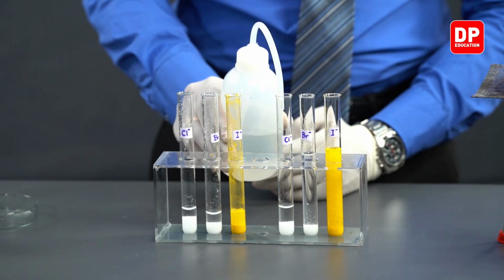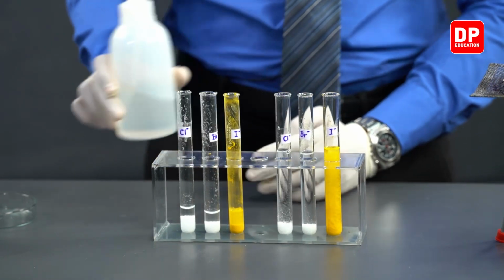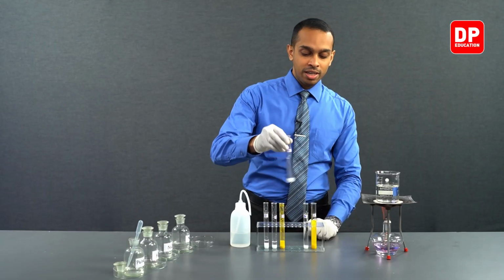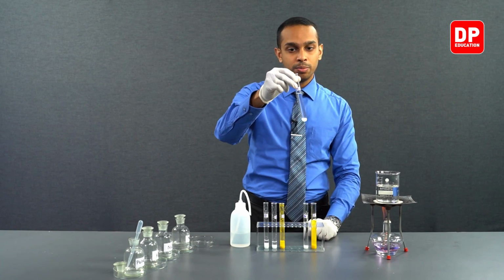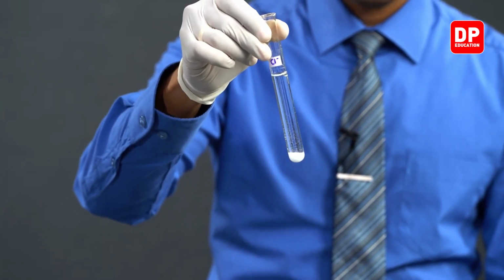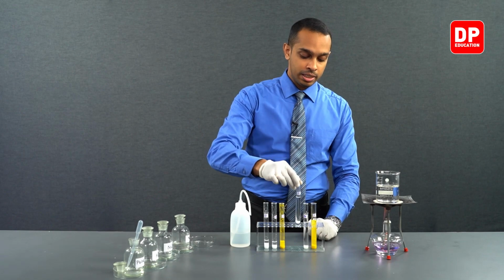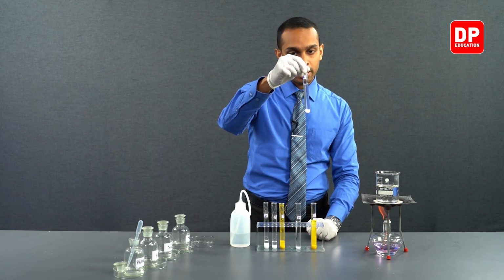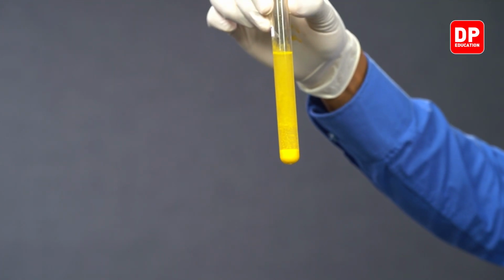I'm using a wash bottle to add a little bit of distilled water onto these three test tubes. Now students, you can see even after adding a little bit of water, the precipitates still prevail. They are still present: this is lead chloride, a white color precipitate. Lead bromide is still present as a white color precipitate. And lead iodide is still present as a yellow color precipitate.